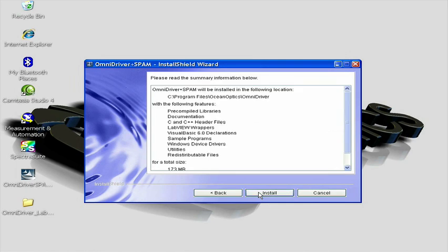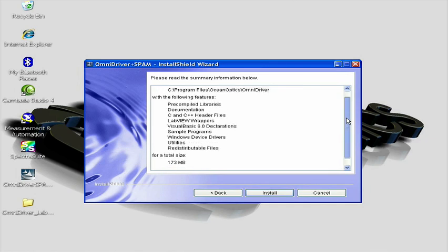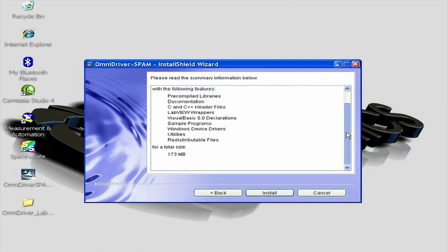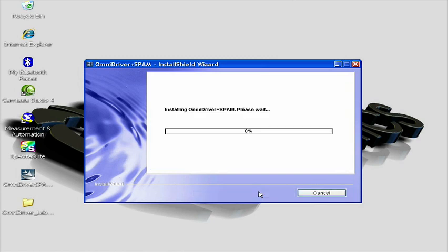A summary of the files to be installed, as well as their sizes, is now displayed in the next screen. Clicking Install begins the actual installation onto your PC.